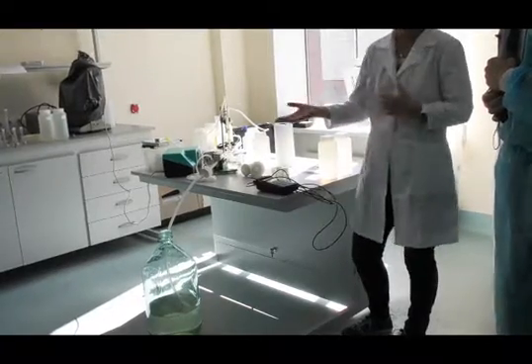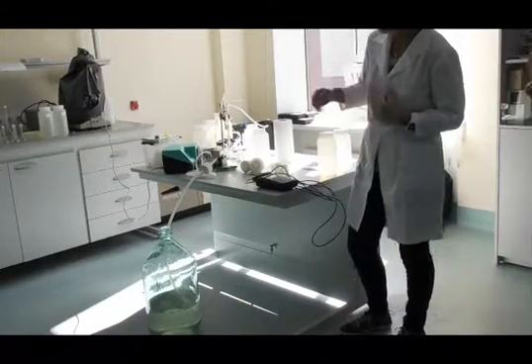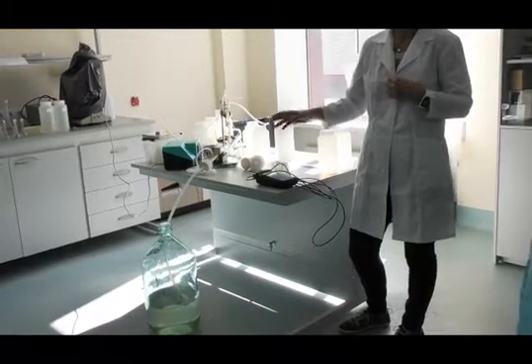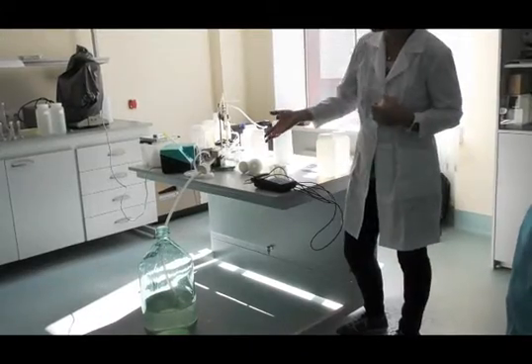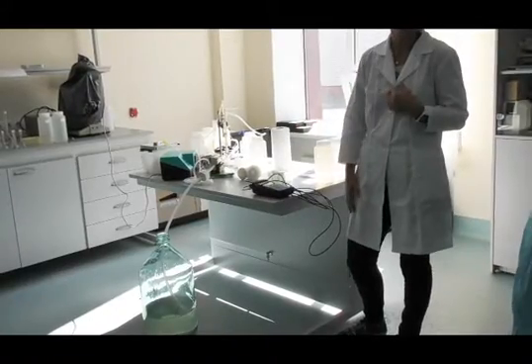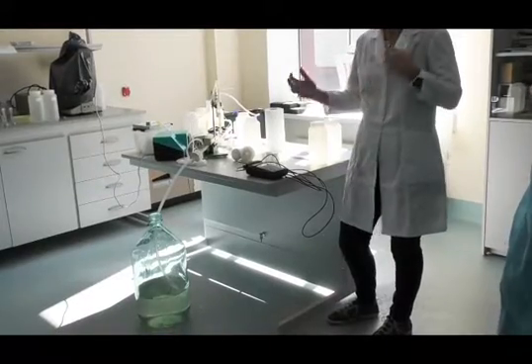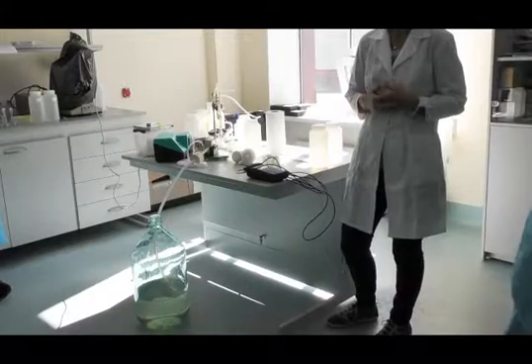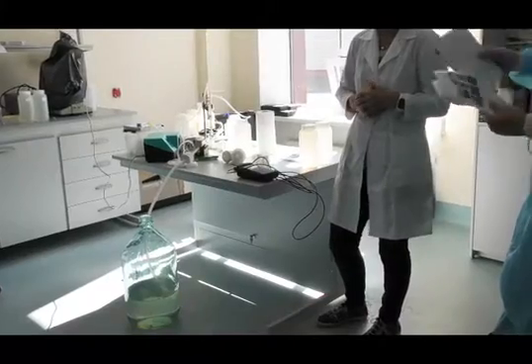And then of course you will have wall problems in the sample when you bring it into the lab. Especially now with this really high pH in the sample, you will have even more problems with wall effects. So when we filtrate this water, probably we will lose something that sticks to the walls of the bottle. But we can't acidify before we do this, because then we destroy the classification in the different fractions. So again, it should be done in the field.